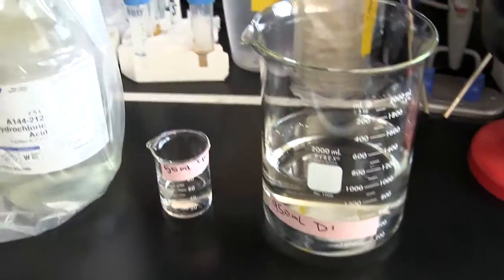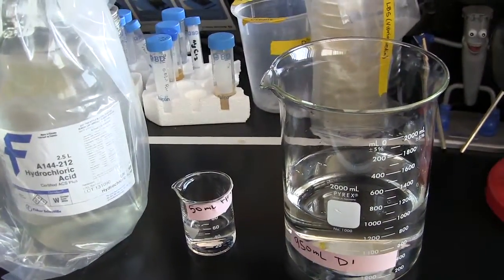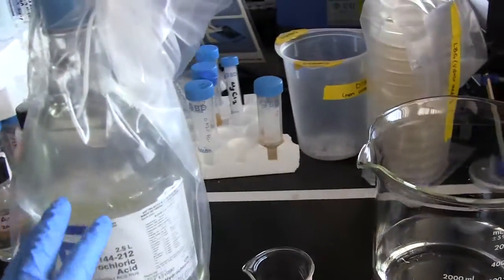What we're going to do when we make a 5% acid bath is make a 1 in 20 dilution of this concentrated stock.